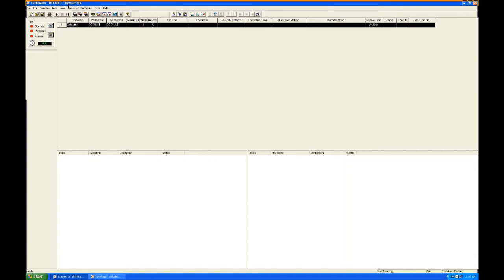Now, this is okay because it's the first time we've opened up the software. We shouldn't have a project, and we shouldn't have a sample list made. But later we'll show that when we do open those, these can change because we'll have different sample lists and different projects open.